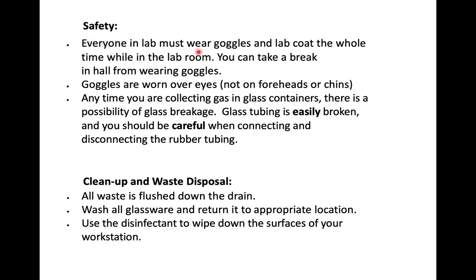Safety: everyone in the lab must wear goggles and lab coat the whole period. You can take a break in the hall from wearing goggles if you need to. Remember, again, wear goggles over your eyes, not on foreheads or chins. Anytime you're collecting gas in glass containers, there's a possibility of glass breakage. Glass tubing is easily broken, and you should be careful when connecting and disconnecting the rubber tubing.